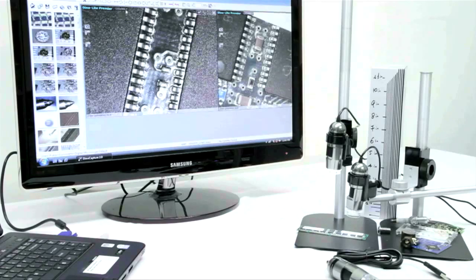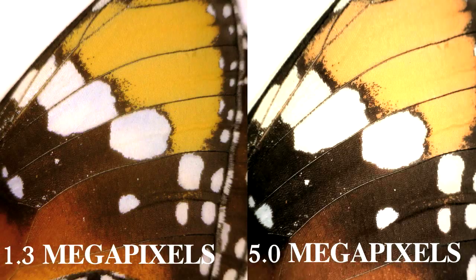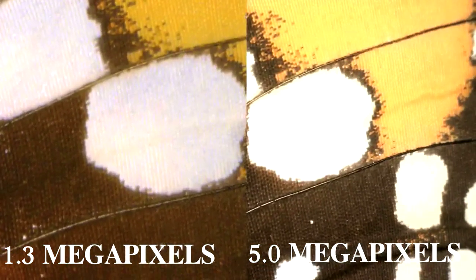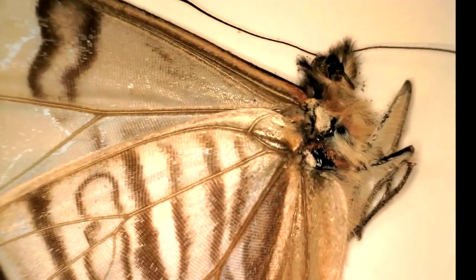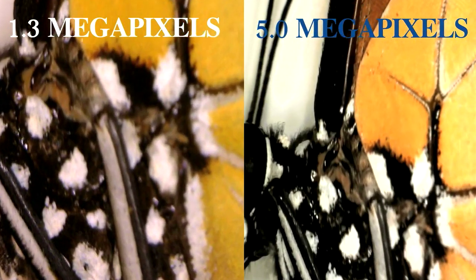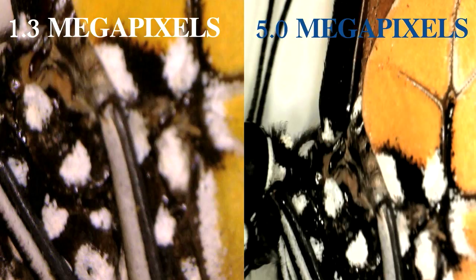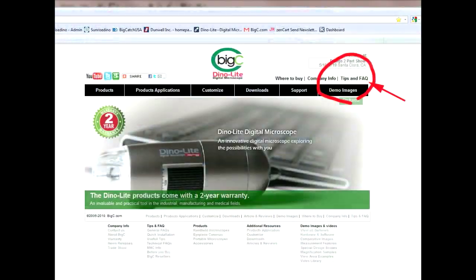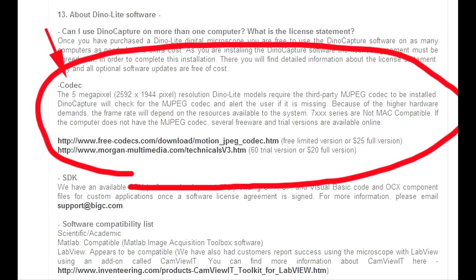Right now we are working with a 1280 by 960 resolution image on our screen. With this model you can also choose a 2 megapixel, 3 megapixel, and 5 megapixel. Upon switching to the 5 megapixel resolution setting, when using your 7000 series microscope, you may notice a pop-up message prompting you to download the MJPEG codec. You can find this download for free on our website, bigc.com, under tips and facts.